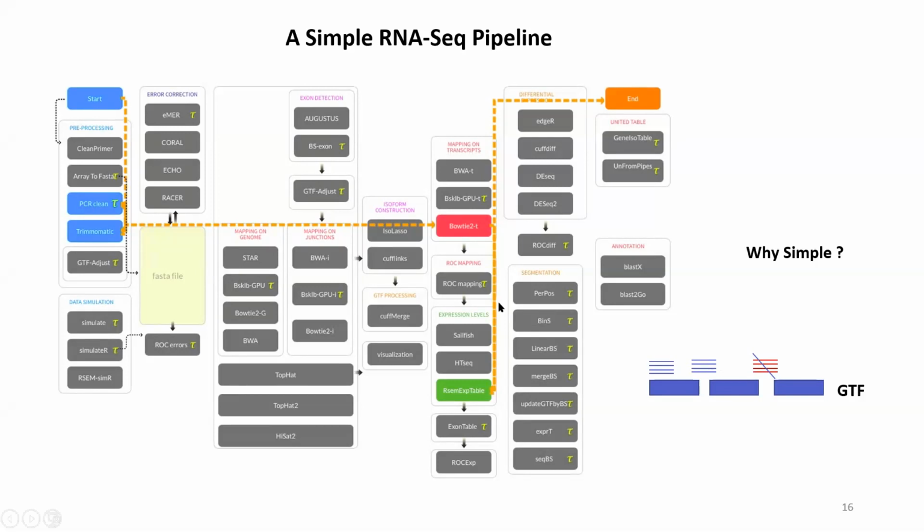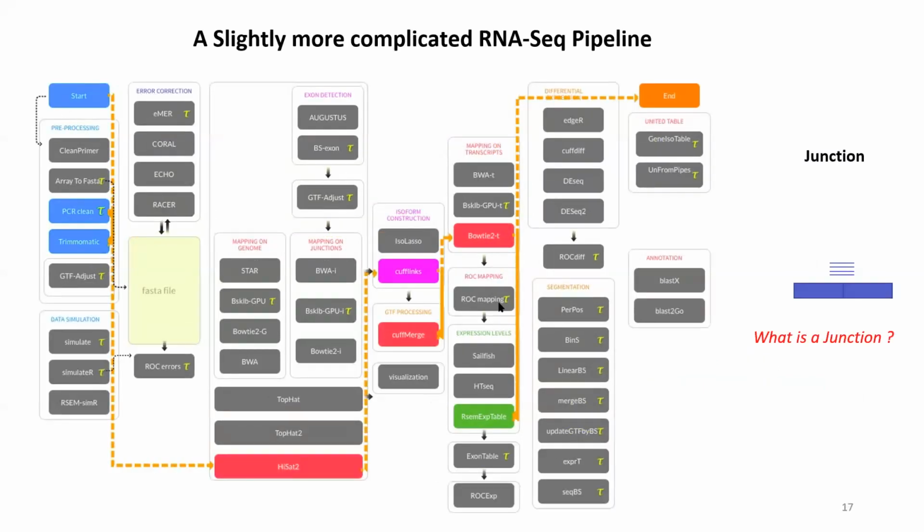So there are several steps. It is not like you build the pipeline in one go and it just runs and gives you the final result. It's an iterative process to understand NGS data sequence analysis, transcriptomics or genomics or anything else. So the next pipeline that takes this into account is slightly more complicated. We can go to the server and build it right now.